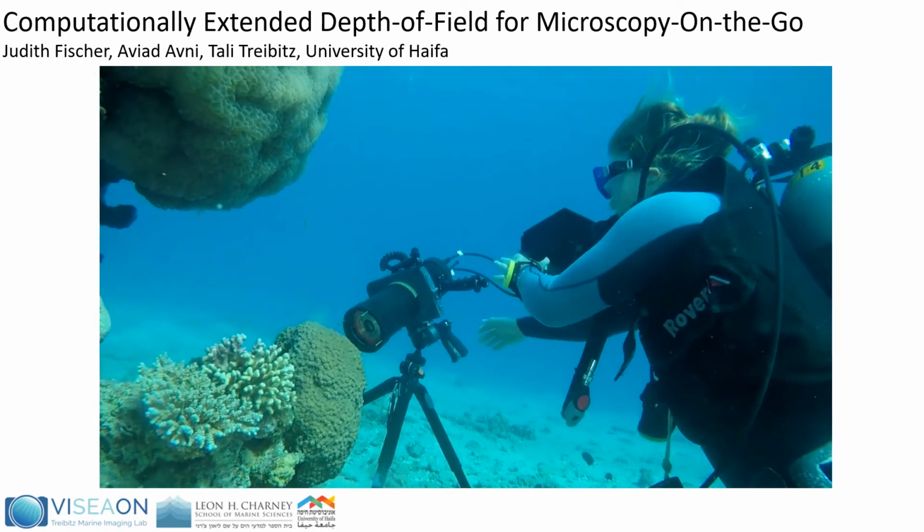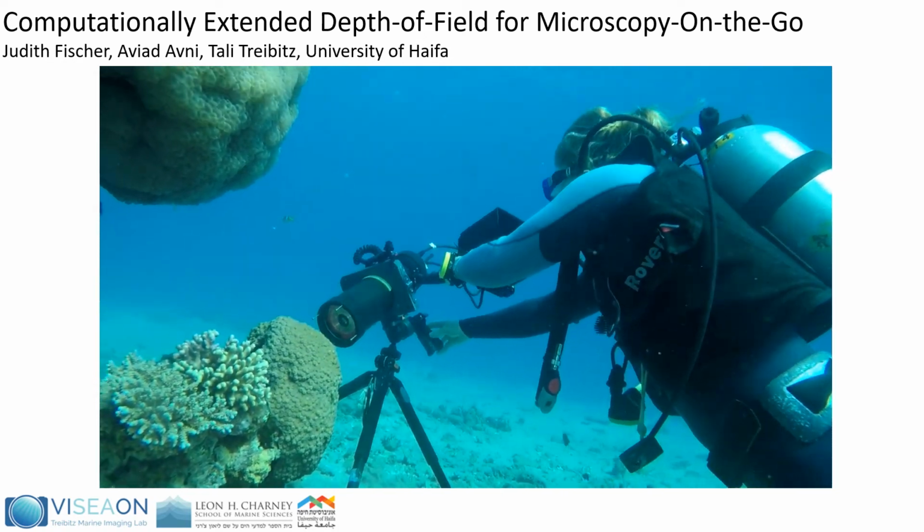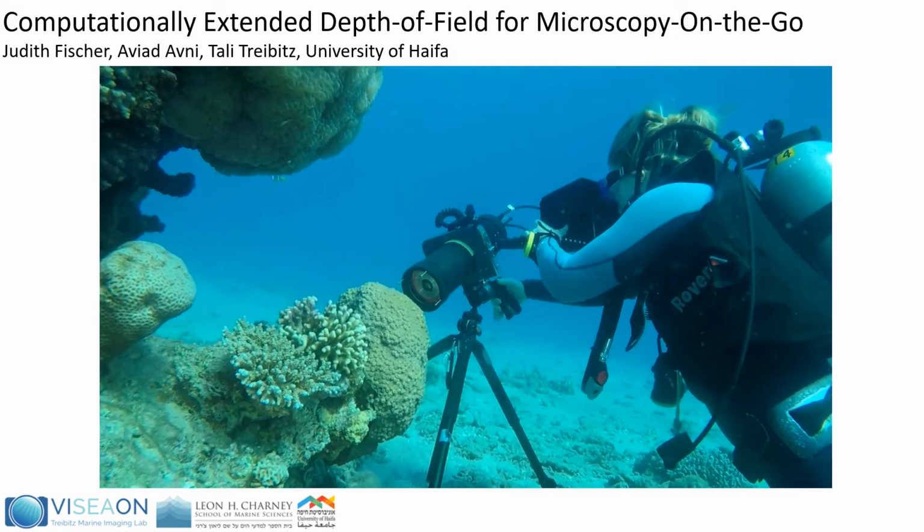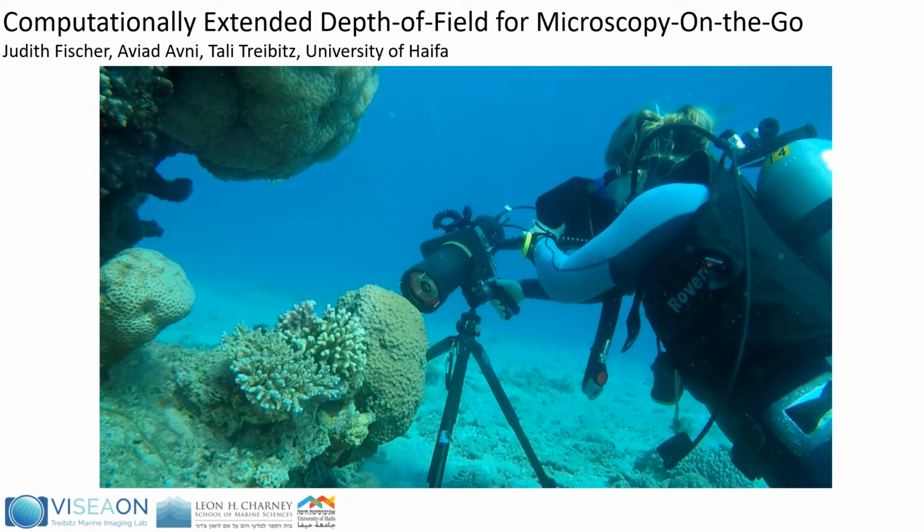My name is Judith Fischer, and I'm a master's student at the University of Haifa in Marine Technologies. This poster presents our work about computationally extended depth of field for microscopy on the go. We asked the question, how can we acquire microscopic images in a dynamic environment such as underwater?